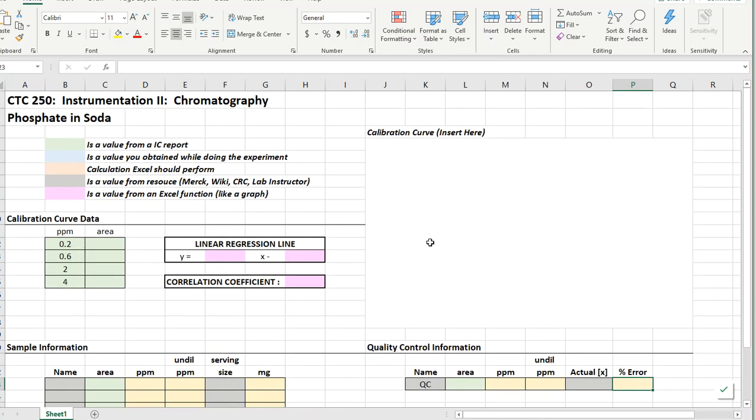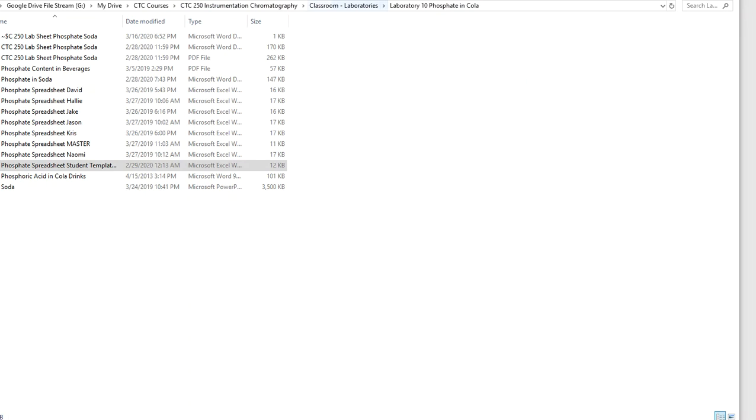So that template is up. You're more than welcome to use that template or create your own. Most people use it though. Save you some time. Don't be a crazy person. Only thing you got to do is key in your numbers, plot a chart, and then everything there is organized very well. All right?